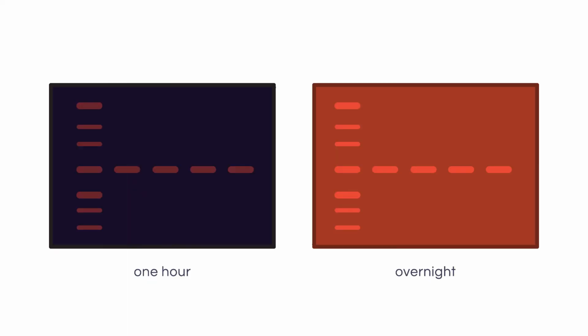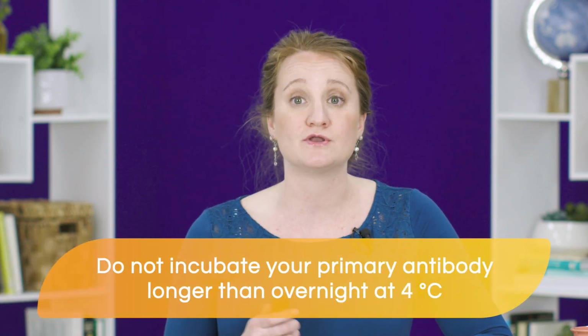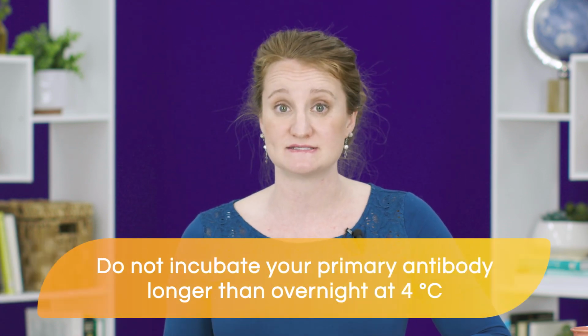If you choose to incubate your membrane overnight, this will typically lead to a higher signal for your target because the primary antibody now has more time to find your target protein. However, you may also see higher background in your membrane because your primary antibody has more opportunity to bind to the membrane. So you don't want to incubate your primary antibody for any longer than overnight at 4 degrees Celsius.